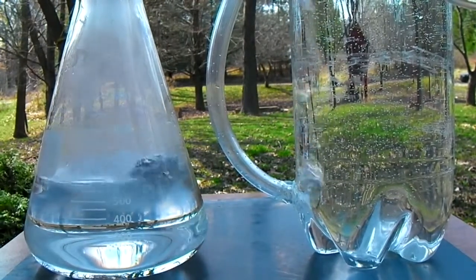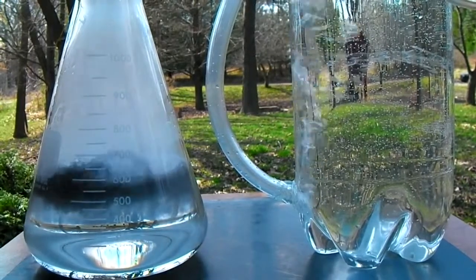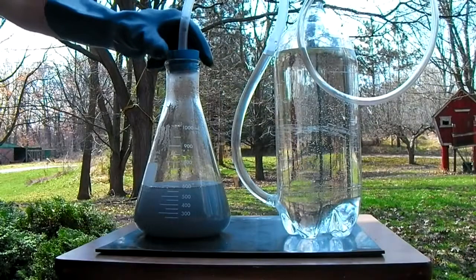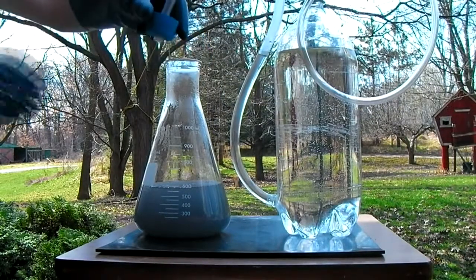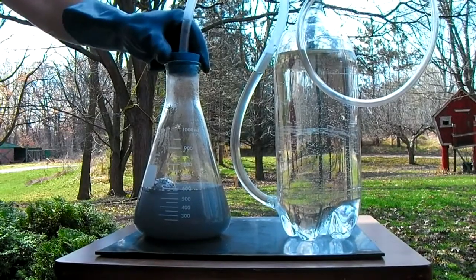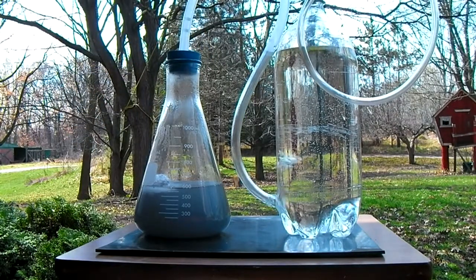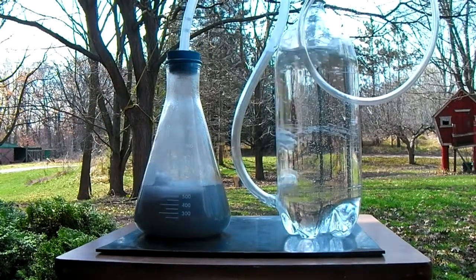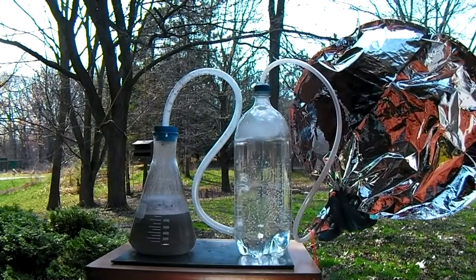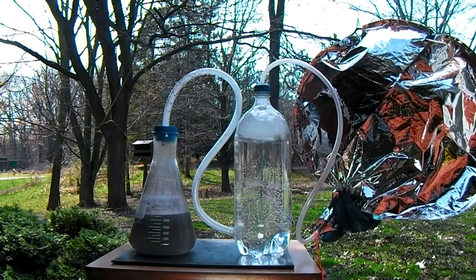The aluminum reacts with the acid producing hydrogen gas and leaving behind aluminum chloride in the solution. Once the reaction slows to a stop, the stopper on the flask can be removed and another section of aluminum foil dropped in. This process can be repeated until a reaction no longer occurs. In the 300 milliliters of acid that have been added to the flask, there is enough hydrogen to fill about a 30 gallon trash bag.